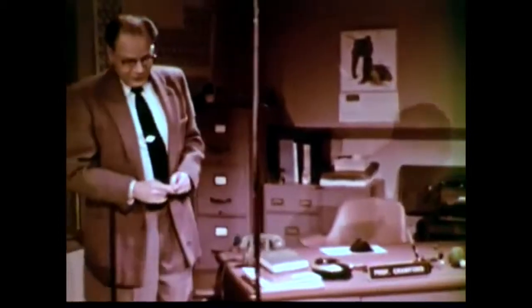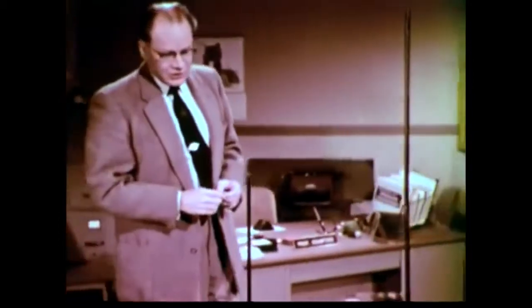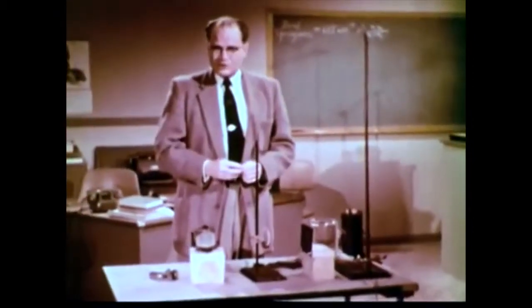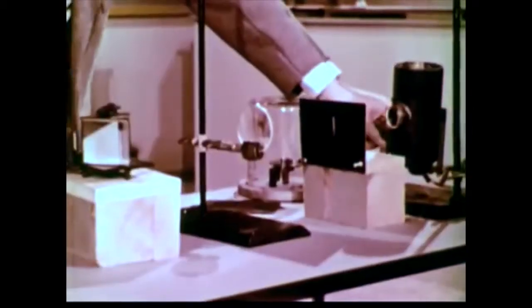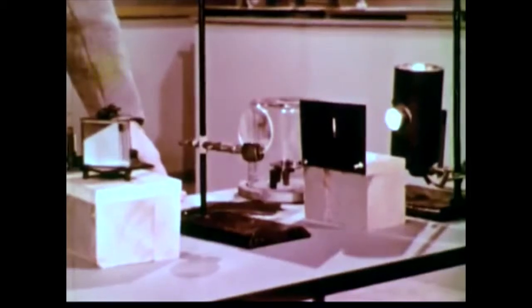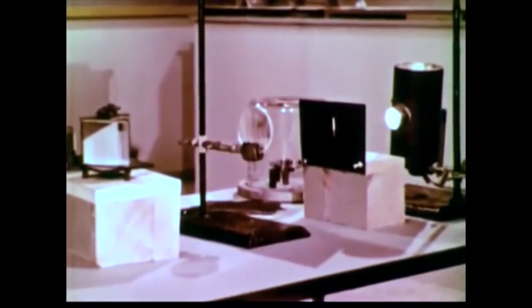At the start of the last century, Herschel set up a spectrum just as Newton had done, except that instead of merely using his eye to examine the colors, he used a detector. To his surprise, the detector showed the presence of radiation even beyond the red end of the visible spectrum.